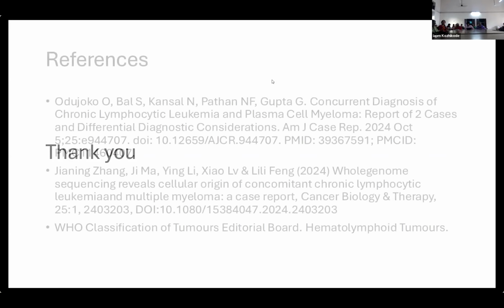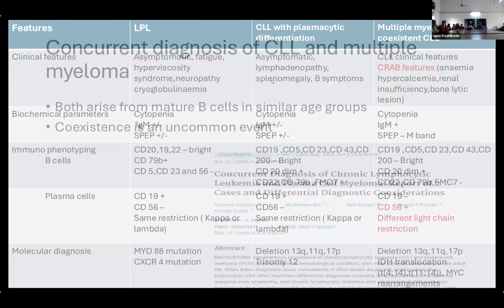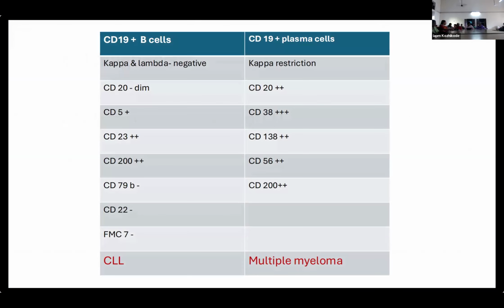Thank you, Dr. Shalini. Any questions from the audience? The negativity in CLL that you got, that was your finding, no? What does it mean? Ma'am, which one? No, can you explain about your CLL population being both kappa and lambda negative?